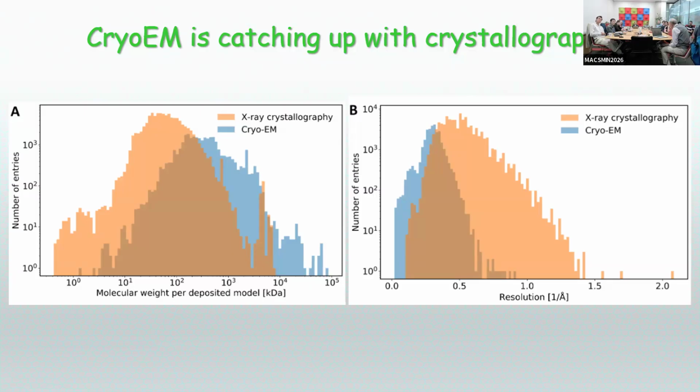And also you can see the resolution, whatever passes for resolution in cryo-EM. I don't want to go into the details, but the definition of resolution in cryo-EM has nothing to do with the definition of resolution in crystal structures, but people still compare them because it's a nice number. So you can see that still the resolution for crystal structures is better than the resolution of cryo-EM structures.